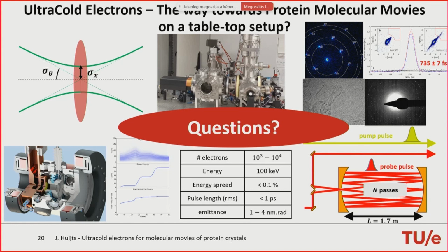With a crystal that is several microns across, you can get tens to hundreds of diffraction patterns from the same crystal before the radiation damage becomes problematic. That does assume a good detector, which we have.